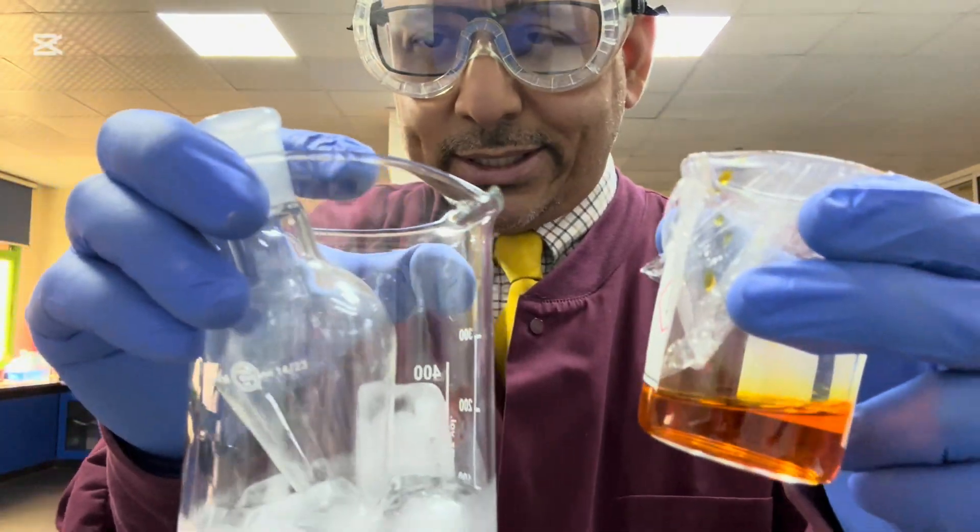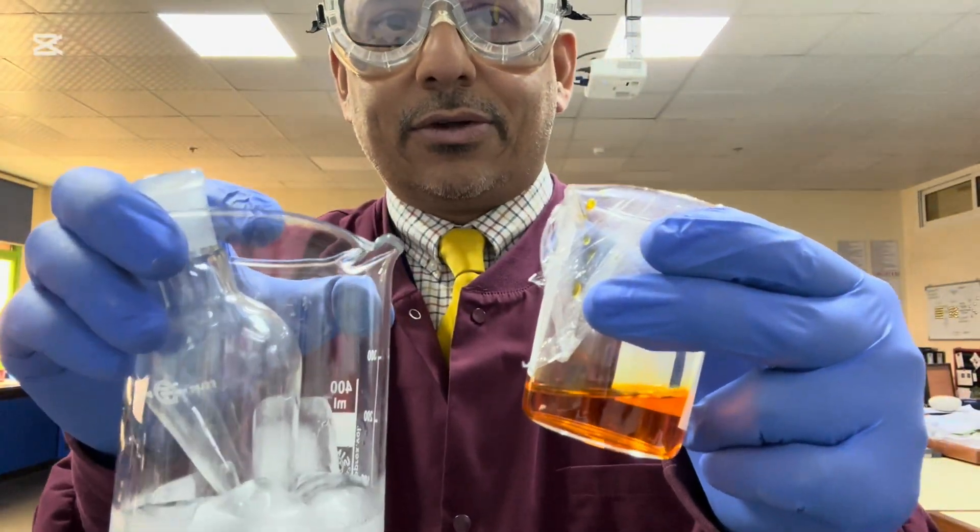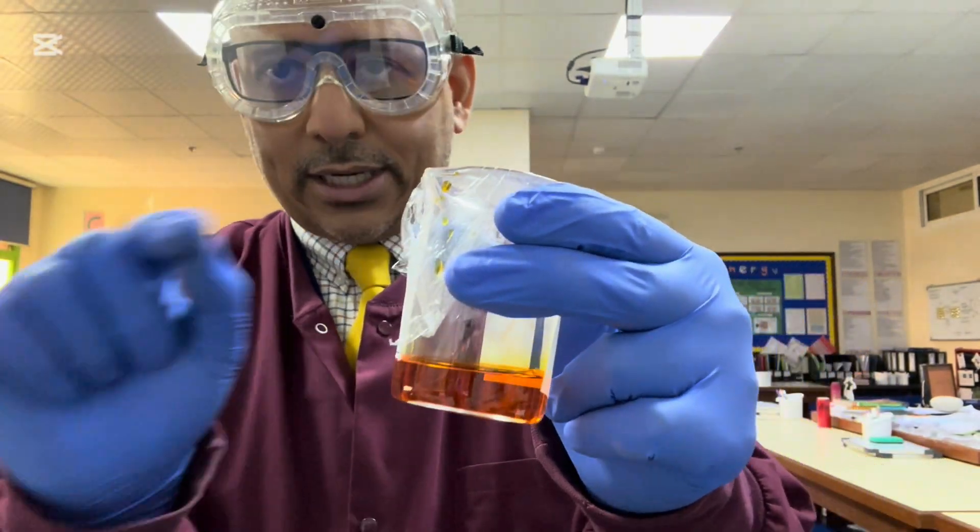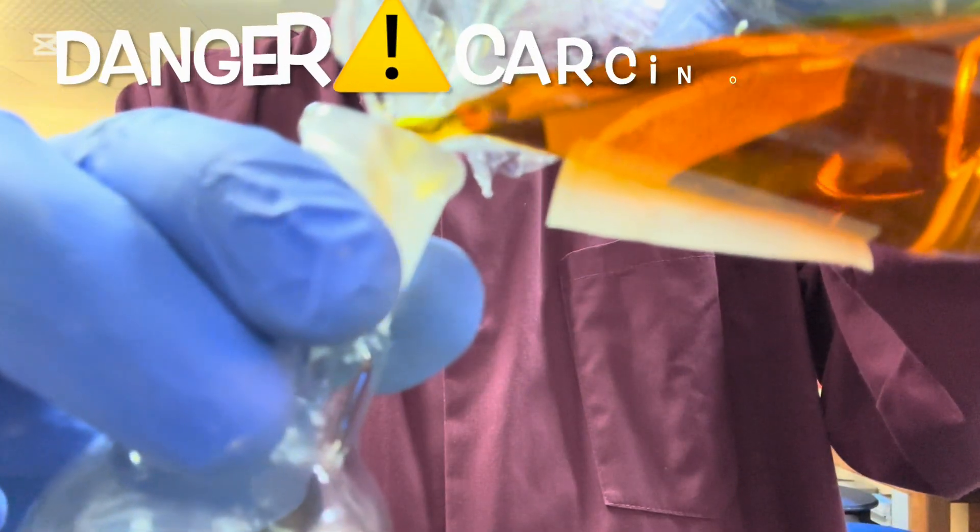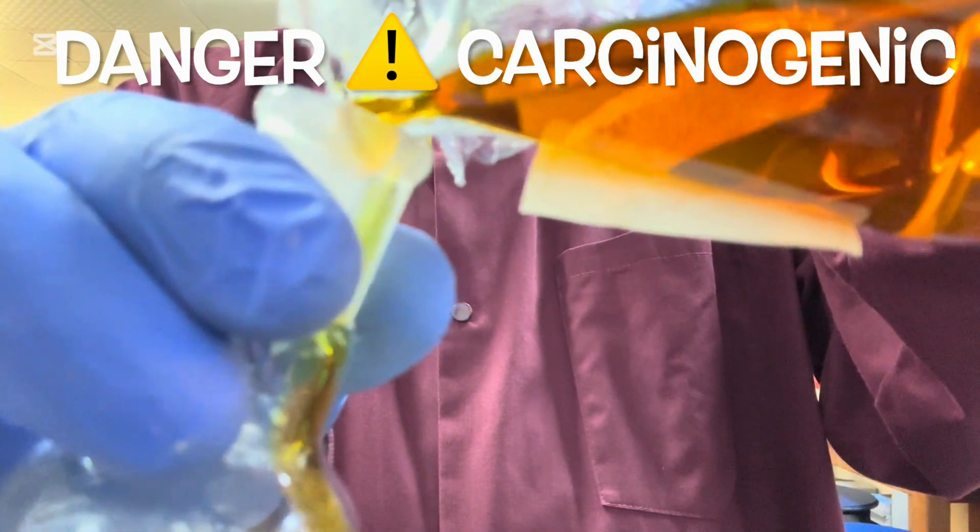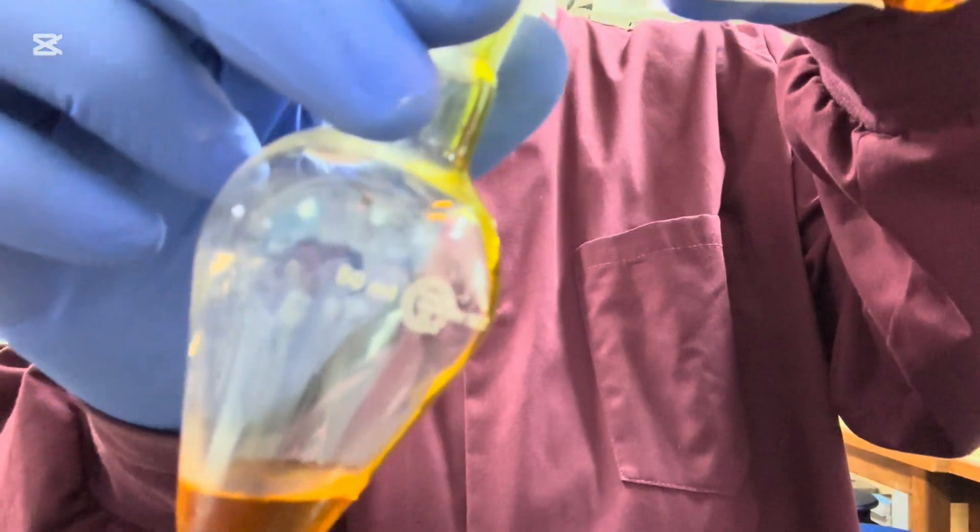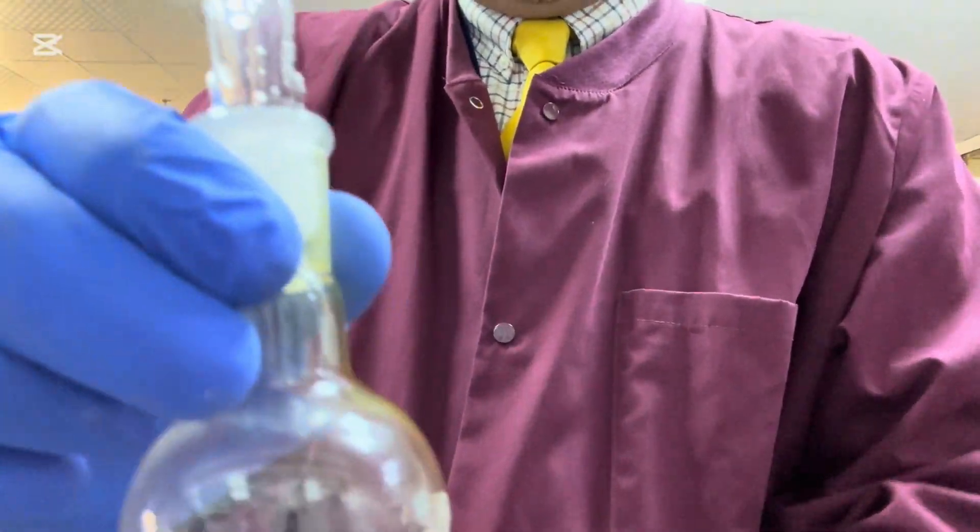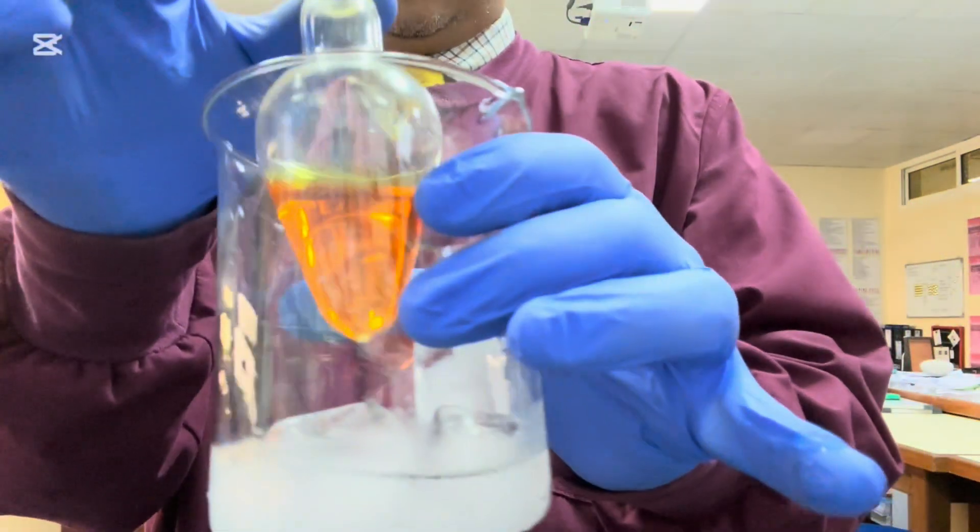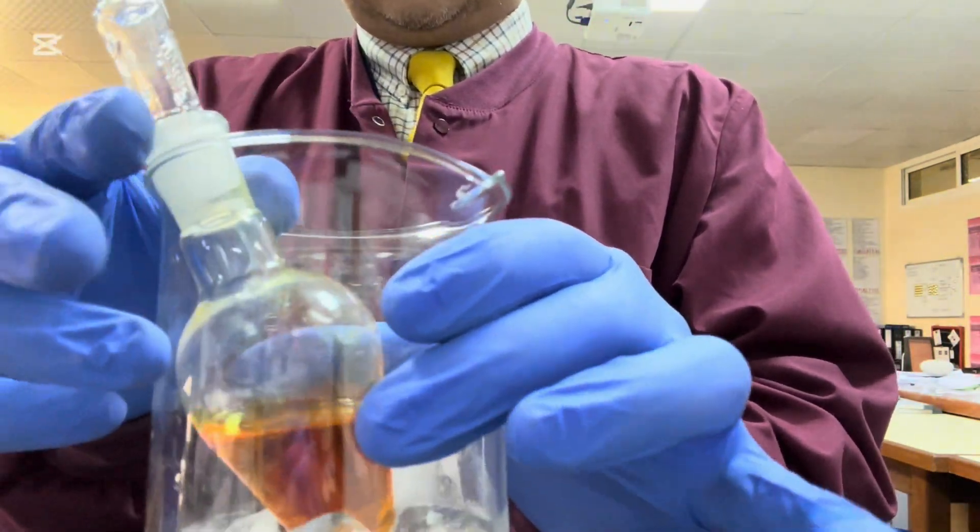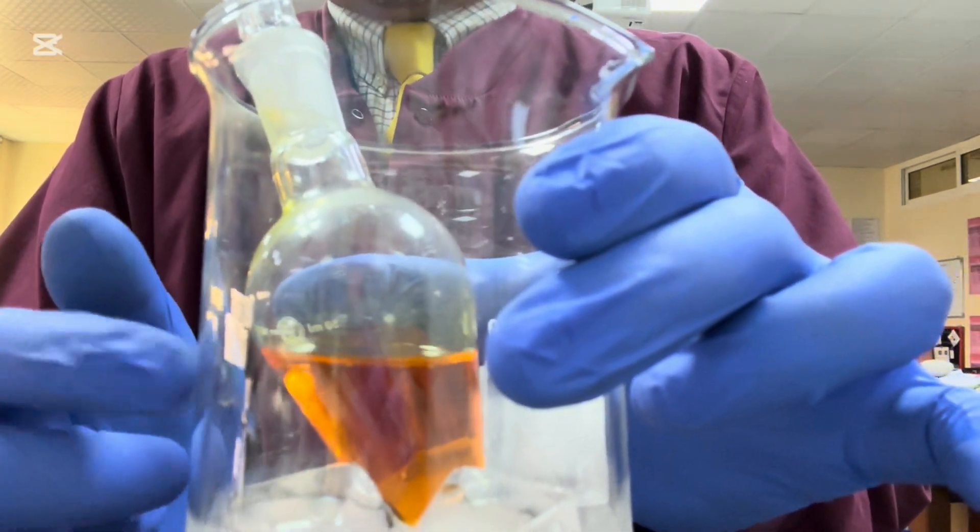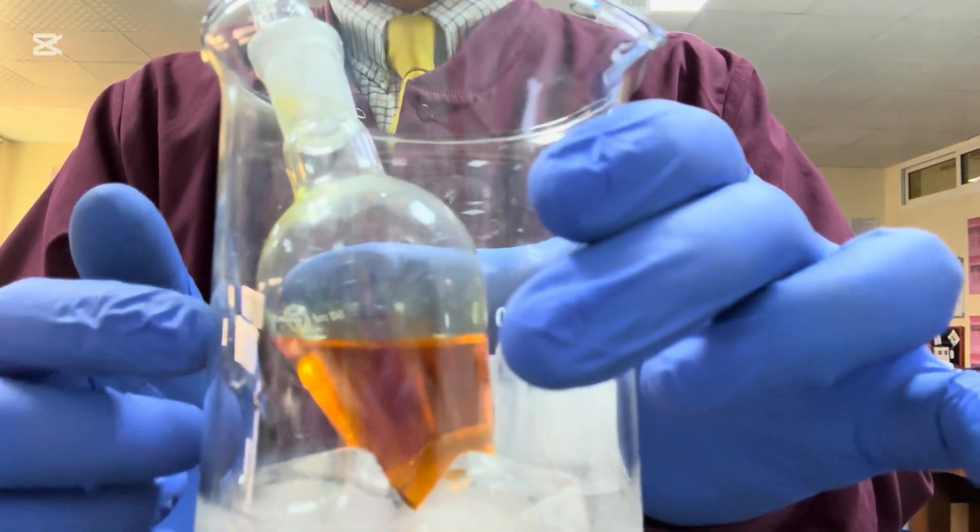And then while that's cooling down, I'm going to set up a flask for distillation, keeping the flask in the ice bath. So I'm going to add it right now, very slowly, so that I don't have any spillages whatsoever. What I'm now going to do is I'm now going to put it in my ice bath and let that cool down. I'll just fill it up to here with water, and I'll just wait a couple of minutes for that to cool down.